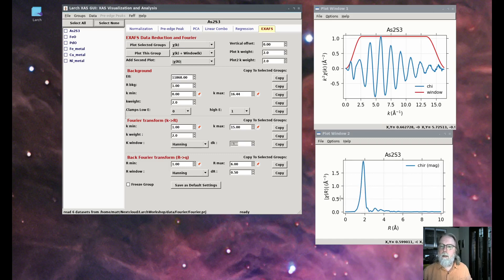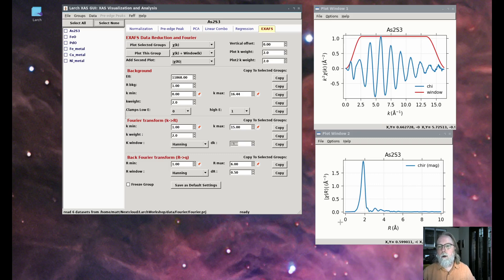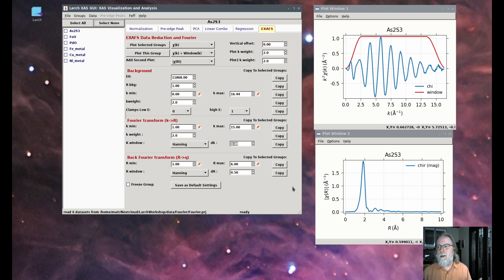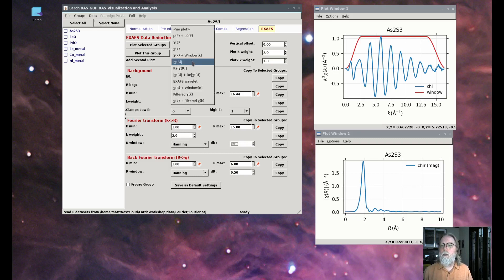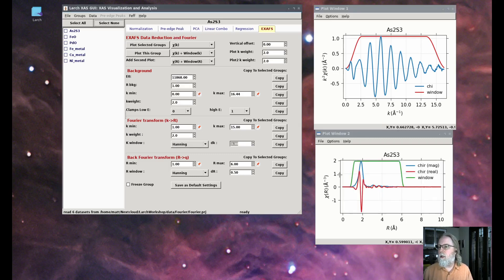That's the Fourier transform to R space. It's typical in the literature, especially the older literature, to also perform a back Fourier transform — from R back to k space — so that you can look at a shell, a specific contribution, as a single thing. We can plot chi of r with another window function that we're going to use for transforming back to k space. That's really just Fourier filtering.